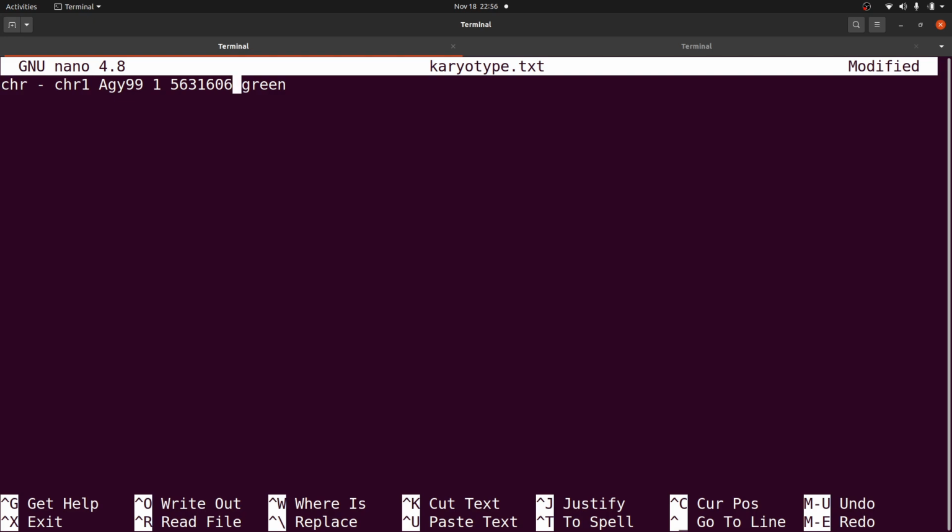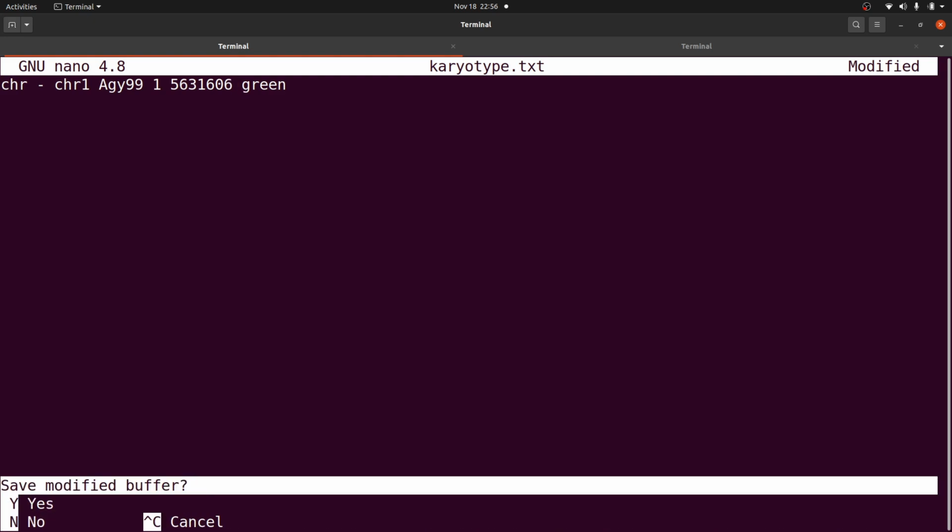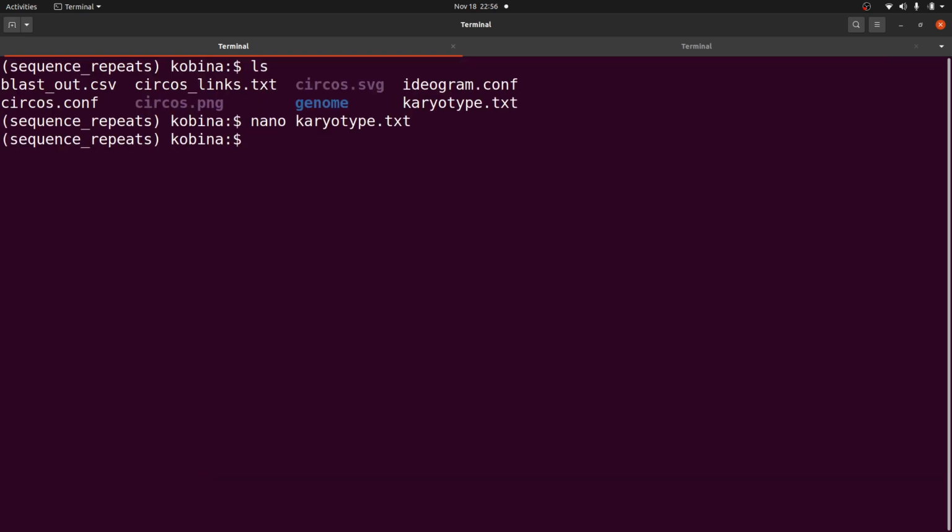Sometimes you may realize that the number you gave for the sequence length, you may want to change it. So it's possible to do that here. Previously we used 5, but then I've changed mine to 6. So I also want you to change it to 6, so that we are all on the same page. So please make sure to do that. It's also a simple command, nano, and then you change it, and you can type Ctrl X and save the changes. So I want you to do that, and then you can proceed.